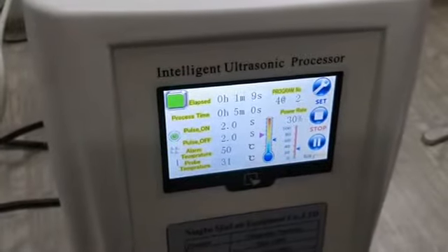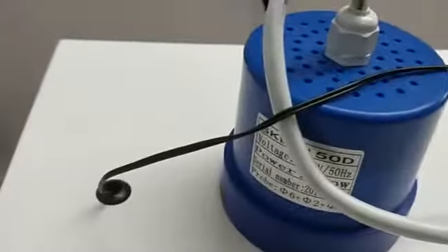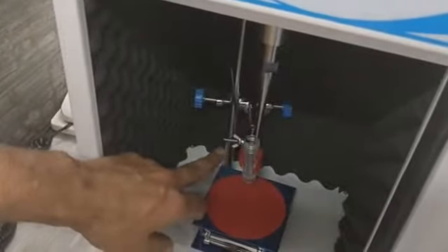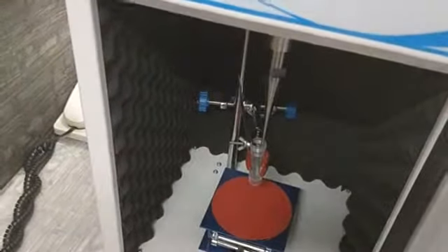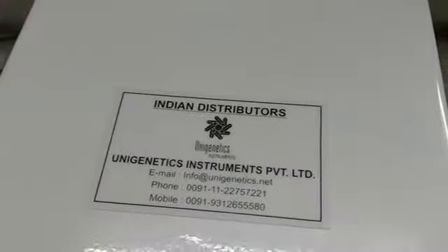In the last, I just slipped one point: what exactly comes with your machine. With your machine, the generator will come, this sound reduction box will come, the transducer with the probe will come. In the accessories, these three tools will come. There are two extra fuses that come, one is 2 amperes and one is 3 amperes. Apart from that, you will get this clip accessory so you can use smaller volumes. We thank you very much for your purchase. We do hope you will have a good time with the machine. Thank you very much.